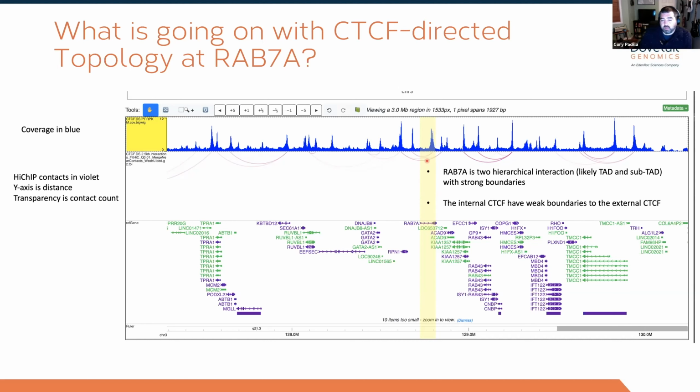So I do want to advise here that boiling down those contact matrix approaches to HiChIP and these contact arcs is really nice. It's really nice because it gives us a reason to go look at a specific site, because we have a p-value that we can say, yep, this is important. But what's missing there is some of the subtleties that are being captured in the HiChIP data. So here what I've plotted is the exact same coverage plot that you see here. And this contact matrix has actually been distilled down into significant interactions.